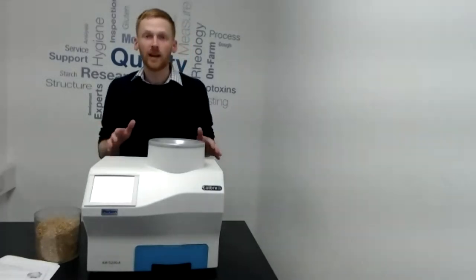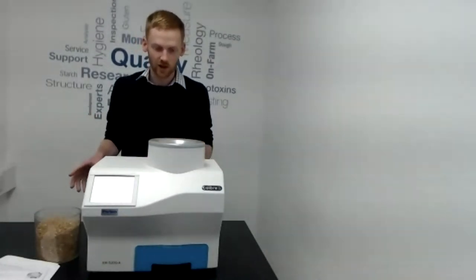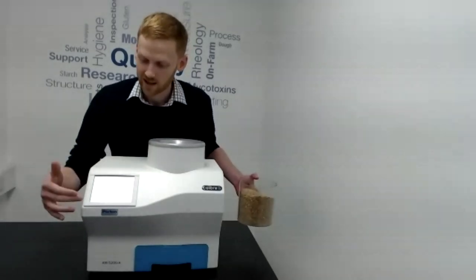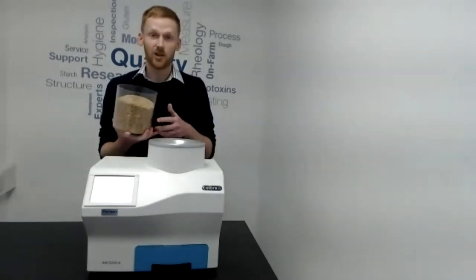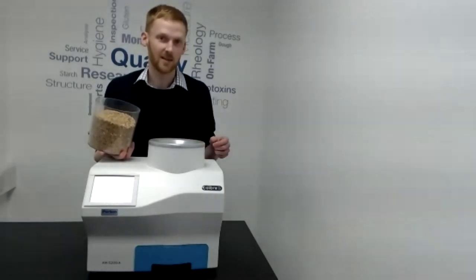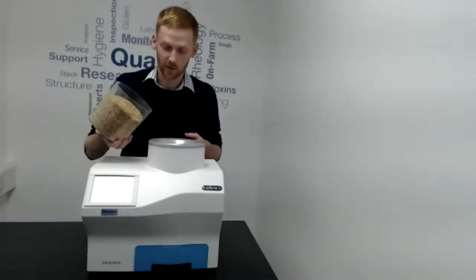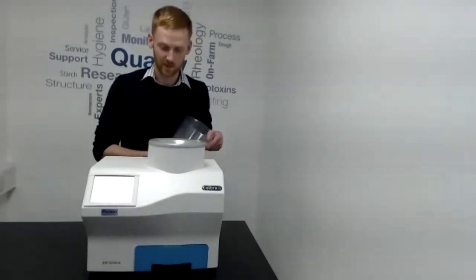We'll run a sample of wheat through the machine — really easy to do. Using the touchscreen, we select our commodity, so select wheat, and then just tip the sample straight into the hopper. When a sample is in the hopper the test will automatically start. You also have the option of entering sample IDs or a note to go with the sample.